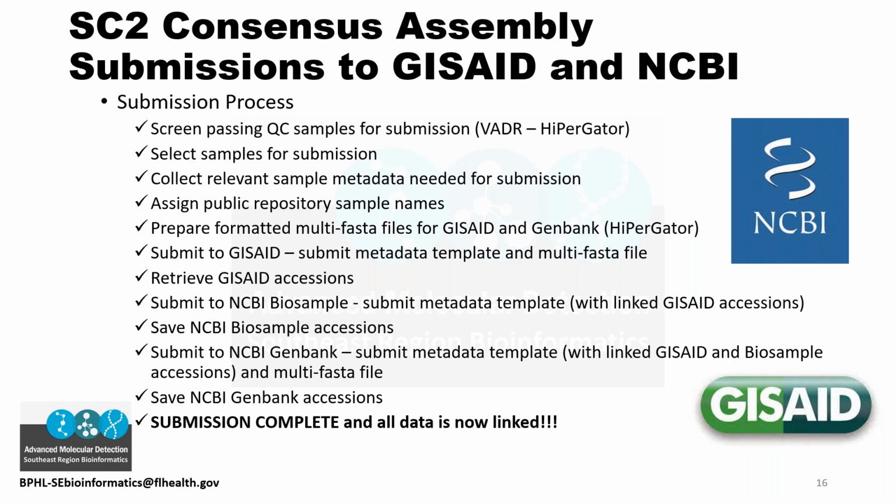And we're going to go through that in tomorrow's training in more detail, about what VADR is, what it is looking for, and whatnot. So you'll need to screen them to see which ones are likely going to get flagged or not, because the different databases have different criteria based on which samples will be accepted and which ones won't. They're doing it based off of annotation pipelines, and some of them will get flagged and rejected, and it has in the past created bottlenecks in the submission process. So we always recommend pre-screening your samples first, which you can do on HiPerGator.